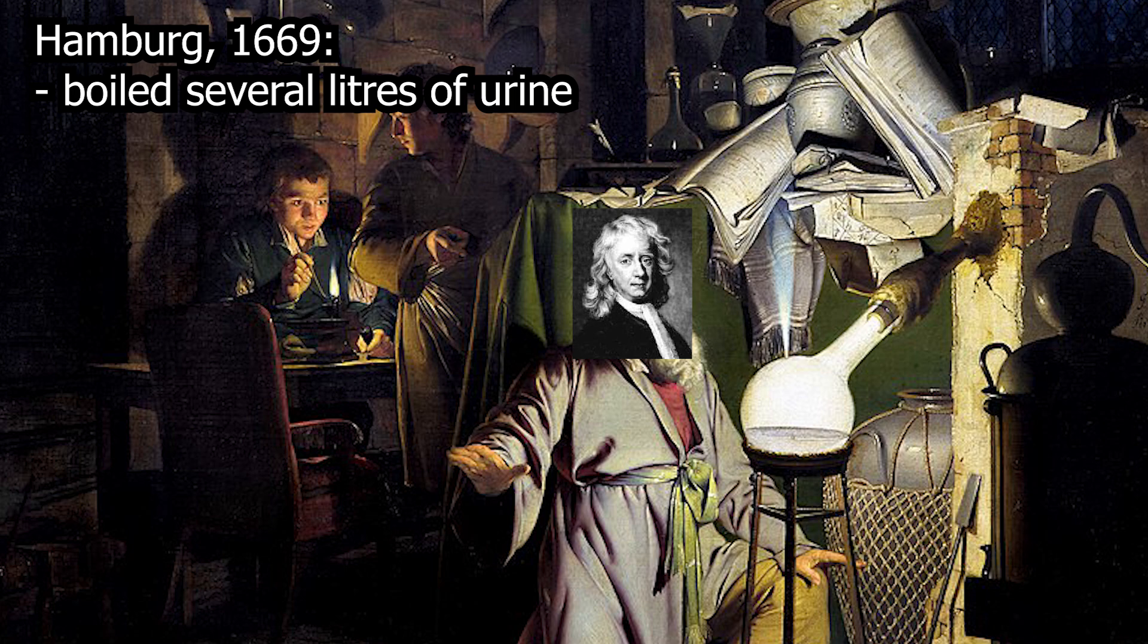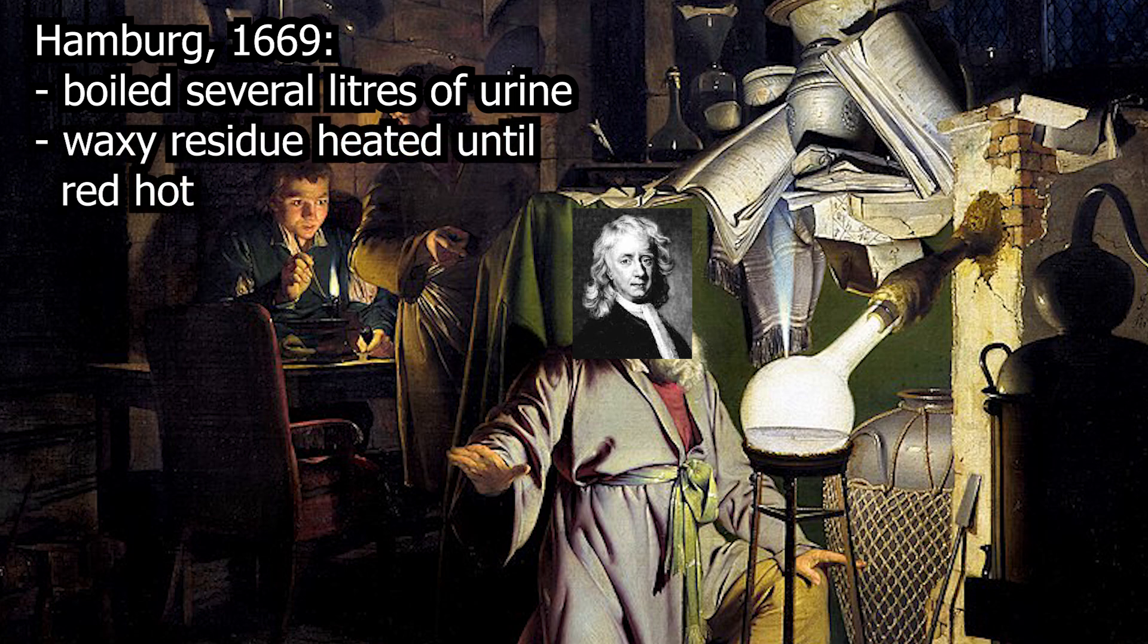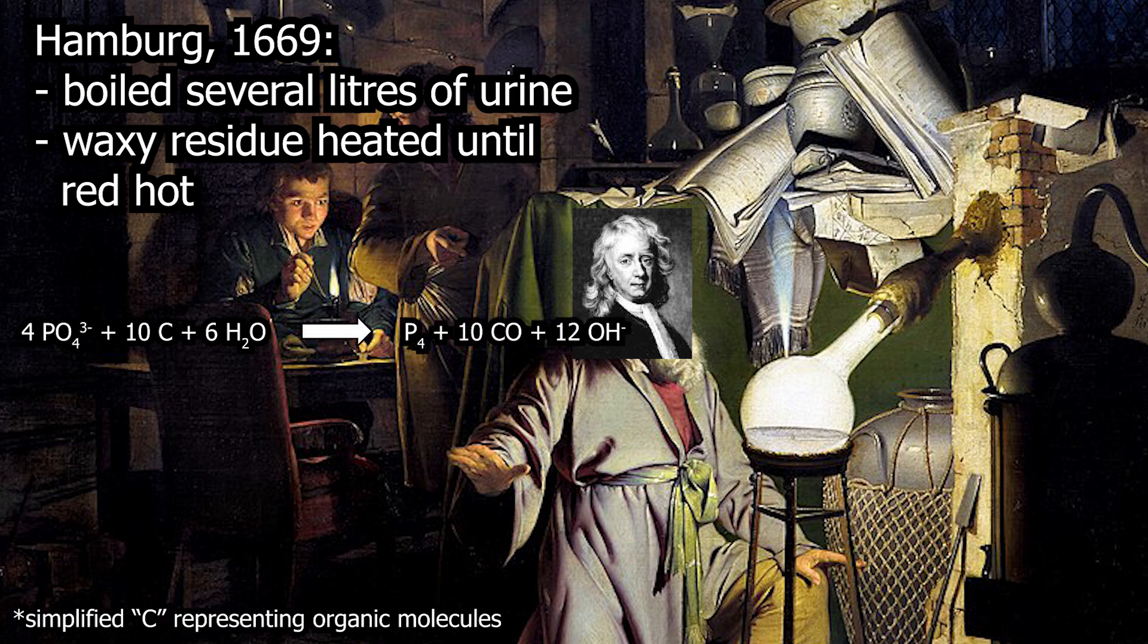This was all left to stand and evaporate and eventually the waxy residue was heated to red hot. I will never recreate that experiment in my entire life. You will have to ask NileRed to do that. And what happened chemically there? The dissolved sodium phosphate contained in the urine was reduced with other organic compounds. In the heat and the absence of oxygen, this produces carbon monoxide and white phosphorus, among other things.